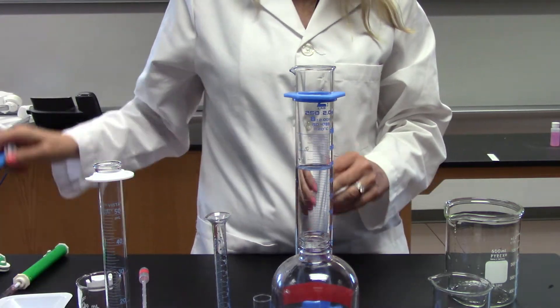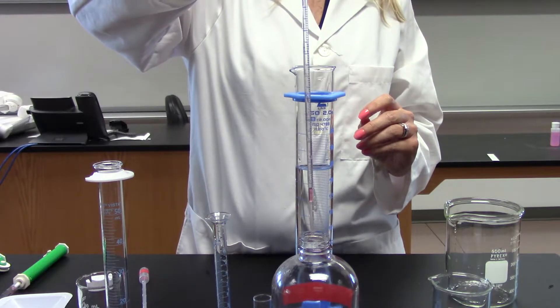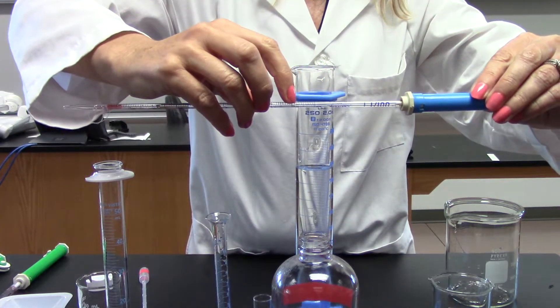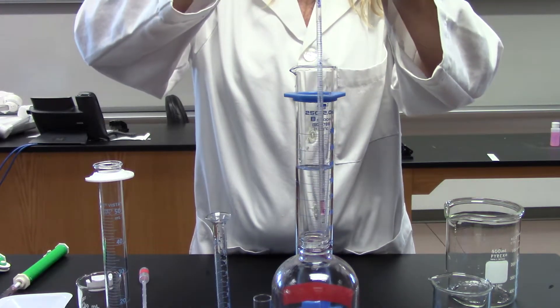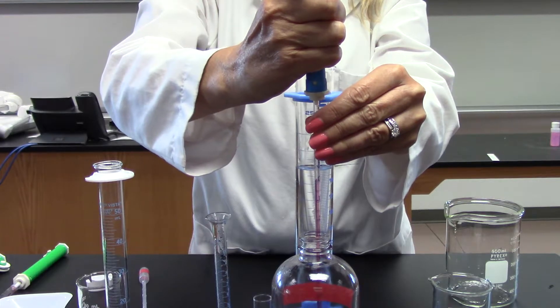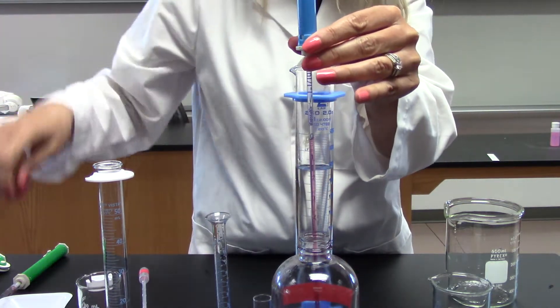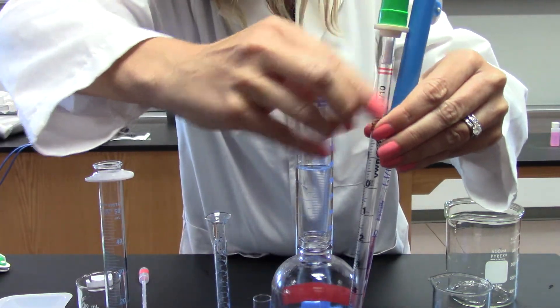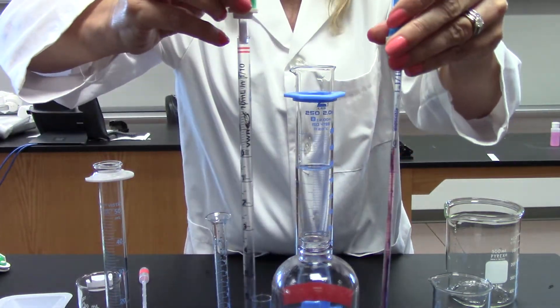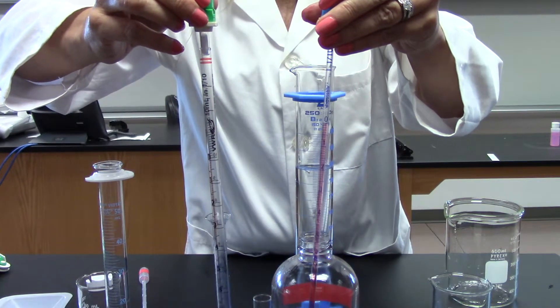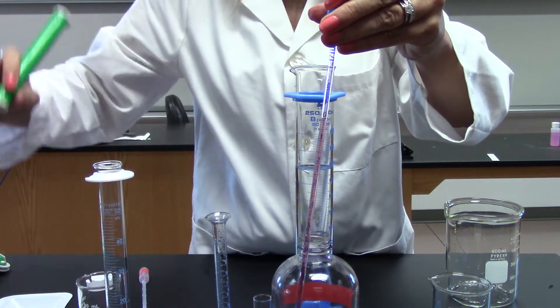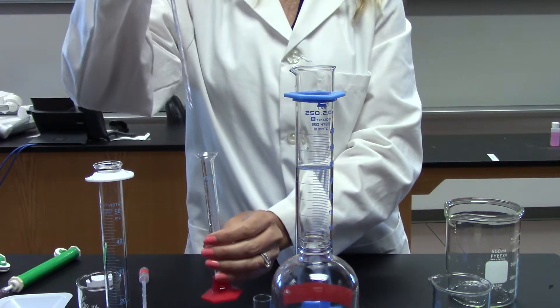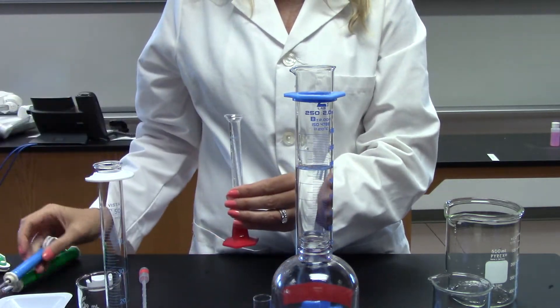That's the 10 milliliter pipette. This is a one milliliter pipette, so this is really accurate. This says one slash one hundred, so each of these little lines is one one hundredth of a milliliter. This entire pipette up to the zero is one milliliter. If you compare with this one, on this one the distance between these two numbers is one milliliter - that's the volume of this full pipette. I could use this to add or remove liquid from a graduated cylinder to get to the exact volume I need.